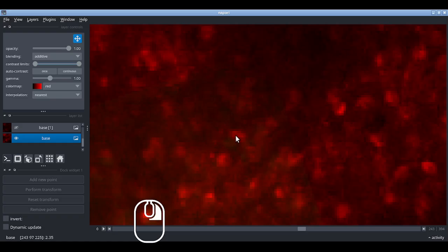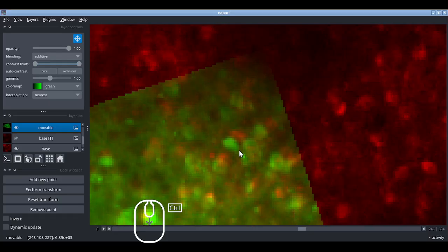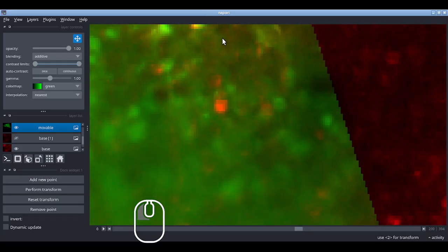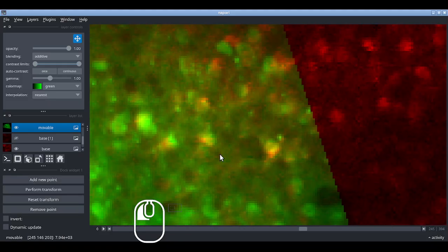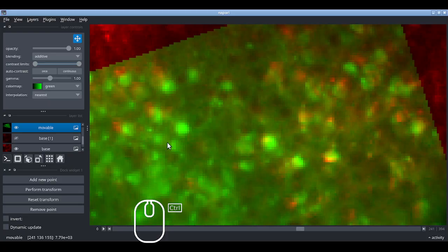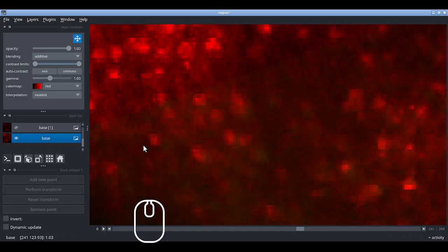Let's do those. And then I'm scrolling a little bit to make sure that it actually did find the right place, and it usually does. Let's go down here. Oh, this is a good one. There. Yeah. And then let's see. Maybe one up here. Oh, what's a good one? Maybe this and this.